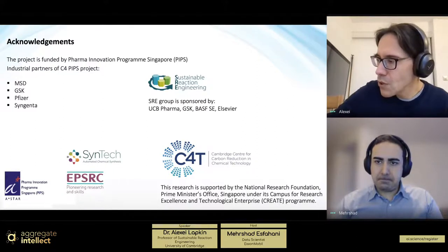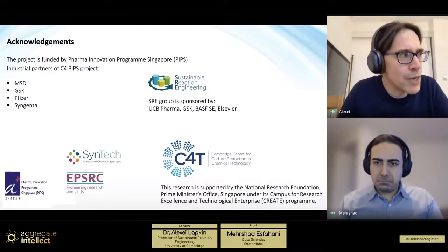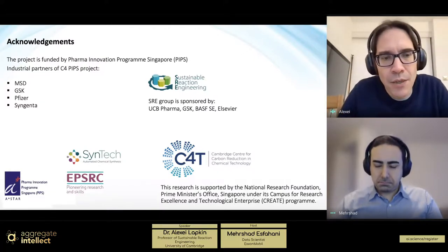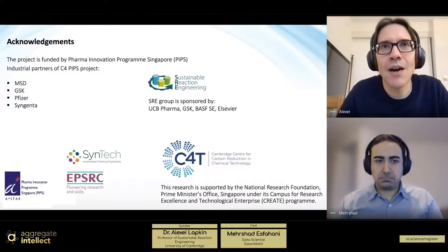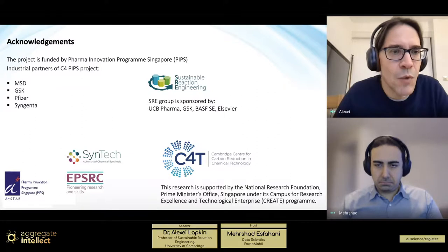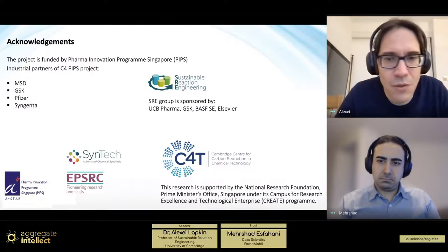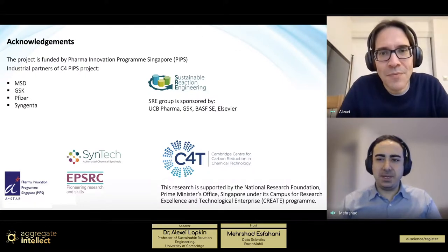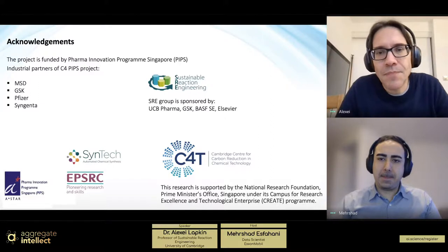We have recoded everything in Python, and the entire interface together with the algorithm behind it, the optimization setup, and the communication with the vendor instruments is now available in Python. It's not yet public. It's done within the project, which has involvement of a bunch of companies listed here on the left: MSD, GSK, Pfizer, Syngenta. We have a question with them about when they would allow us to release it. It's an ongoing conversation. At the moment, it's being considered for adoption with these companies, but I think they don't really want to own it, so we'll release it as soon as we sort out how. That's great. So at least for now, it's going to be free open access, and people can have access to it through GitHub, right? That's correct, yes.